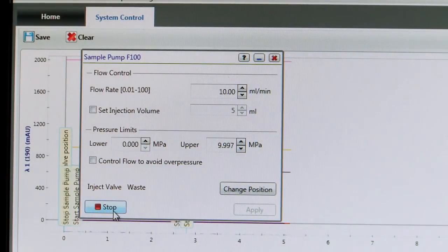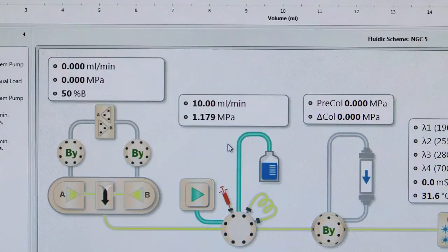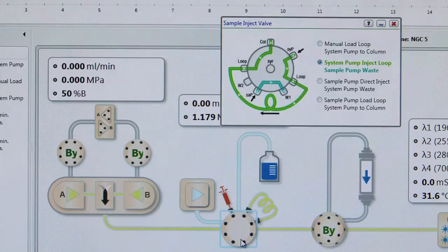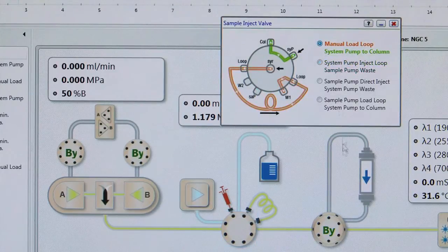After one minute, click Stop and then select Manual Load Loop on the Inject Valve faceplate. Close the faceplates. The system is now purged and ready for manual control.